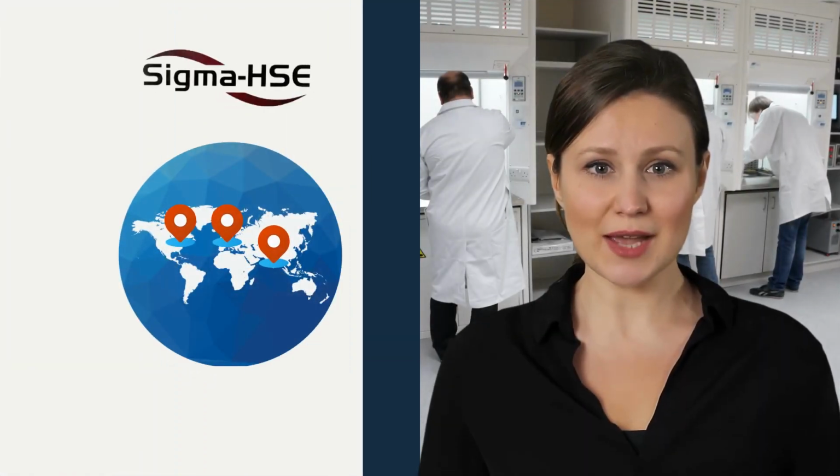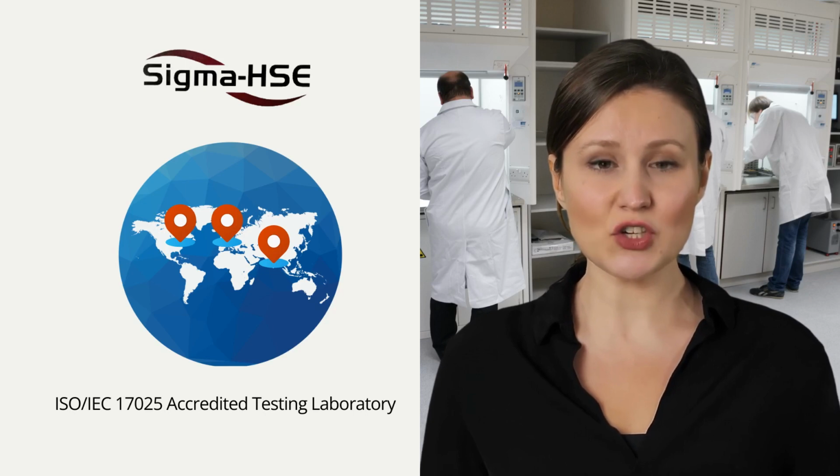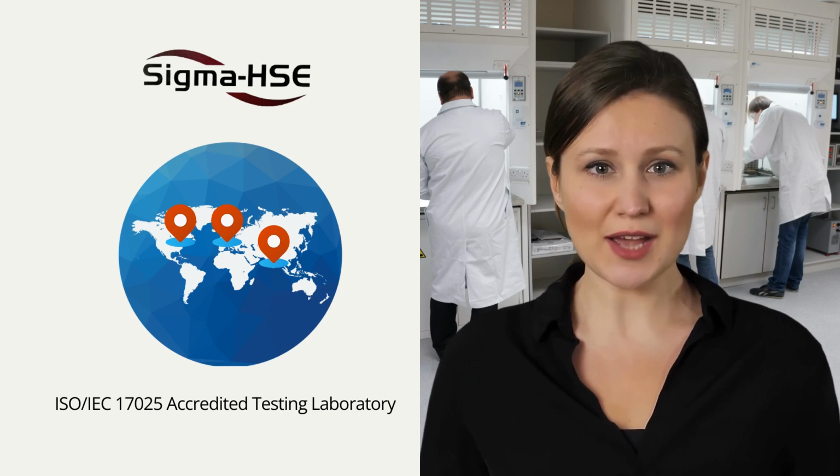Our global accredited laboratories provide a diverse range of tests, allowing you to define the basic material characteristics of your dusts, gases, and vapors, and further define their combustibility and flammability characteristics. These characteristics define the severity of ignition and sensitivity to ignition of your materials. This information will help you understand the hazards in your processes, add appropriate safeguards, and ultimately reduce the risk of your operations. Our laboratories provide consistent, accurate data that represents your real-world industrial challenges cost-effectively and with the shortest turnaround time in the business.